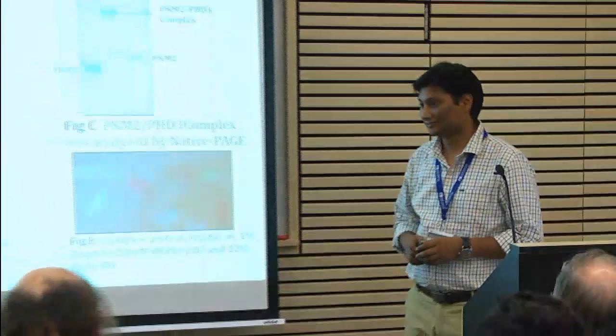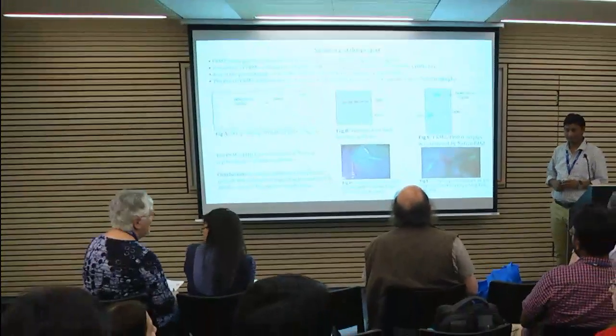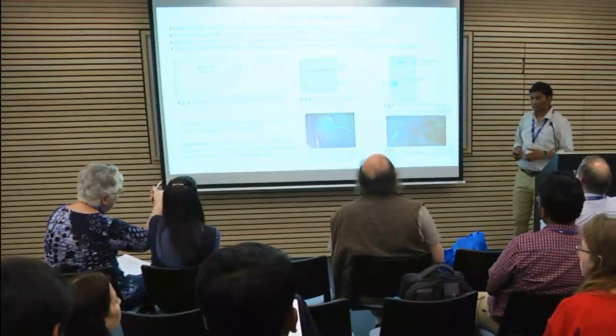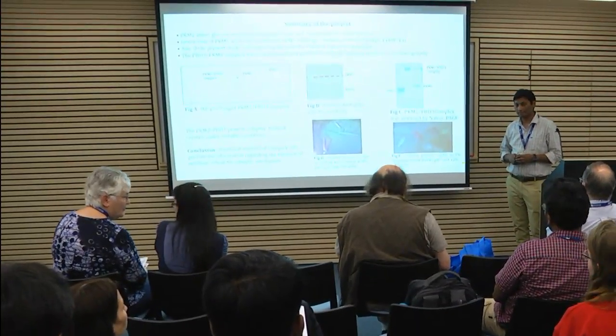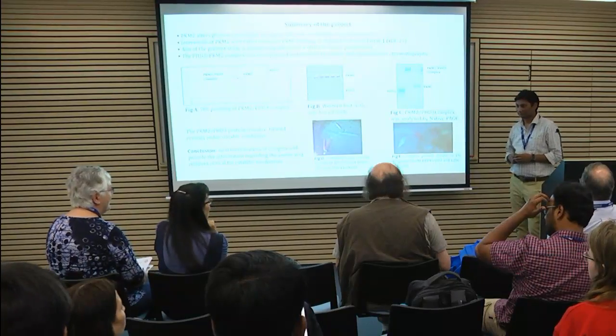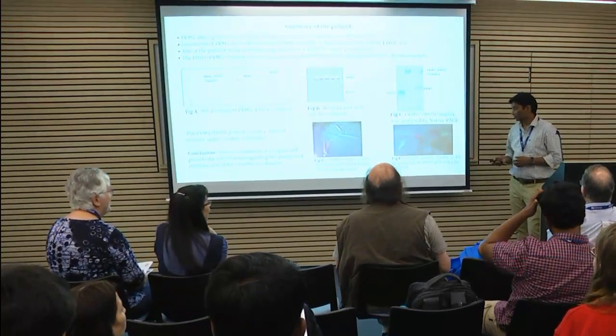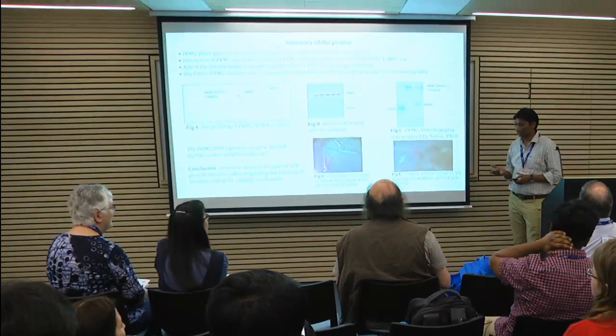And you confirm that you have the complex now? Yes. Did you use the crystal to run it in the native gel? No, not native. We have confirmed on the silver stain. Silver stain. Is it enough for one crystal to do a gel? So it's on SDS. We can't see, but with silver staining we can see the.